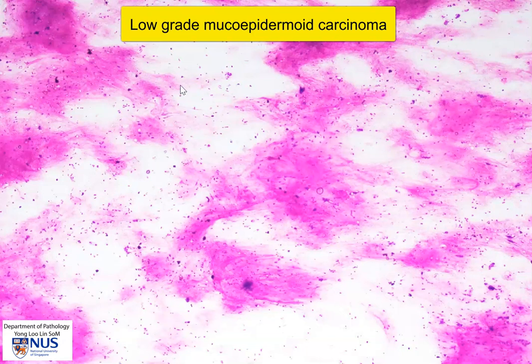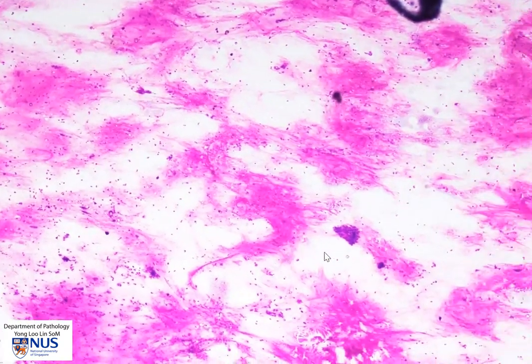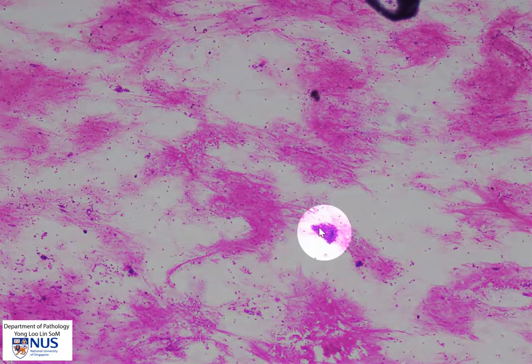This is conventional cytology, and we're looking at the air-dried smear from one of the cases. At low magnification, we can see that it is relatively hypocellular. There is a lot of rather thick mucin in the background, and as we look around, we can see occasional more cohesive clusters of cells.